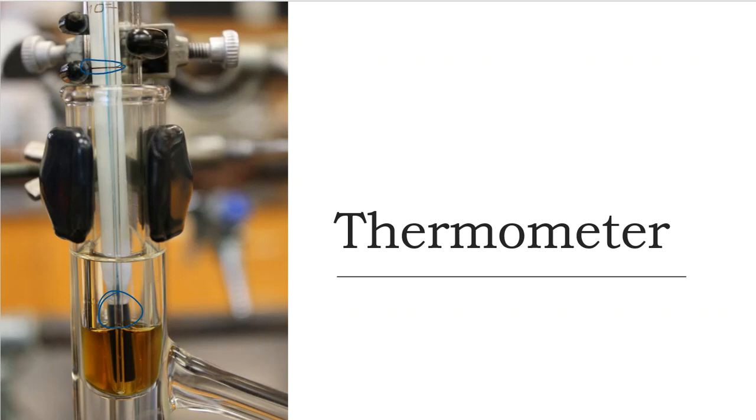Number two, here's this line. That's an immersion line. That means in order for this thermometer to work the proper way, you really need it submerged until that point right there. There's no way I'm going to get that. So this will give me an idea maybe of a boiling point, but by no means will it be perfect. You need to keep that in mind when we begin to analyze the data that's going to come from the end of this lab.